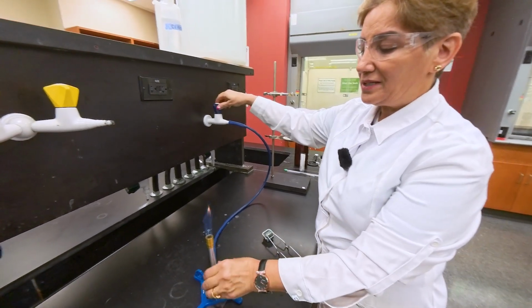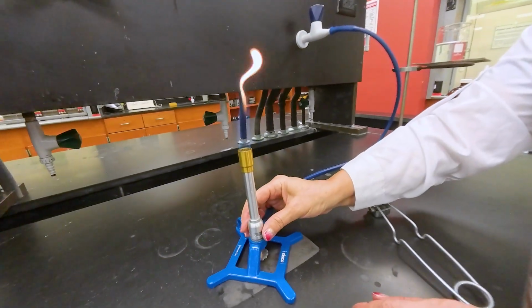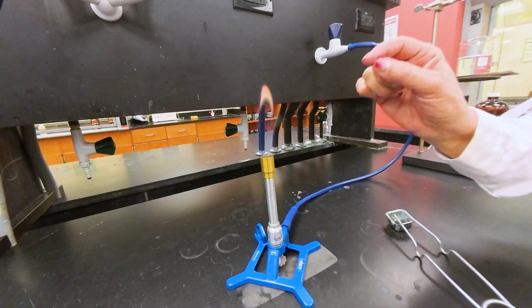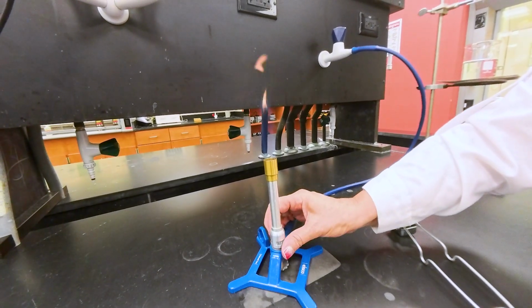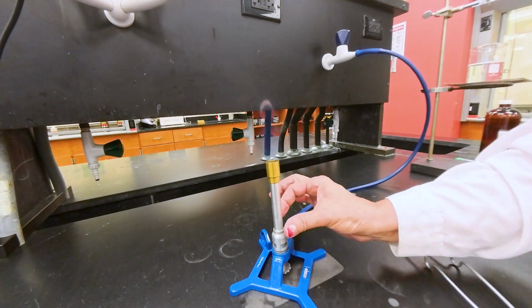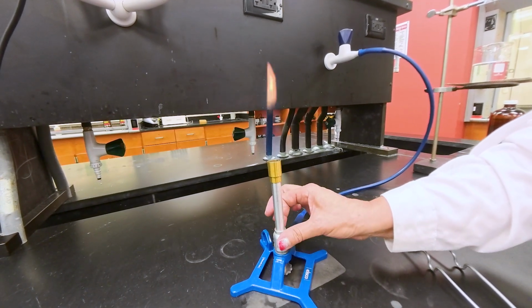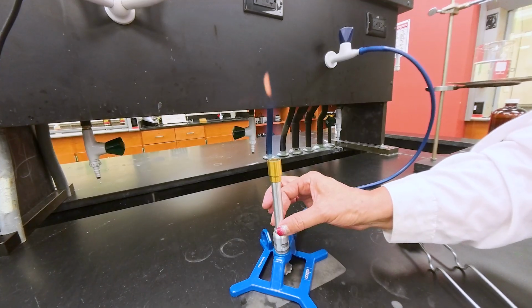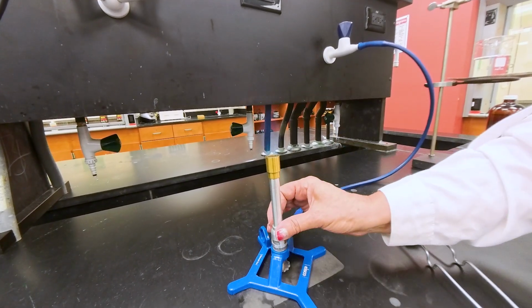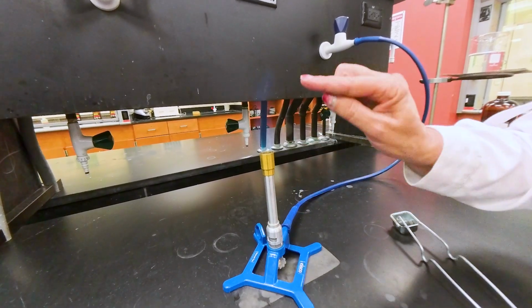When you strike, you want the flame to be a blue color. When it's a yellow color, that's the indication you don't have enough oxygen and carbon monoxide is being produced. So again, you turn this cylinder to the left, righty-tighty, lefty-loosey, until the yellow color goes away. A perfect flame would be blue with 2 or 3 cones.